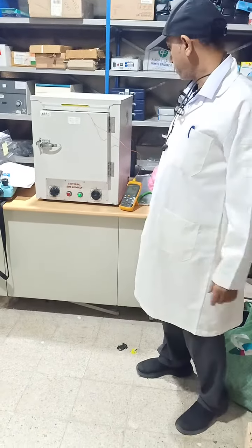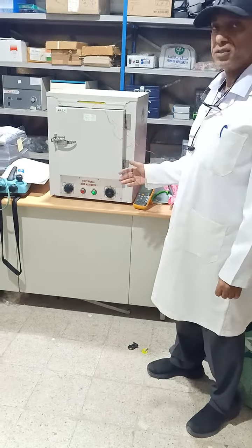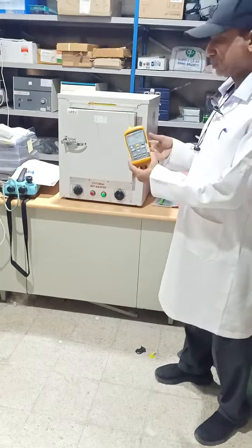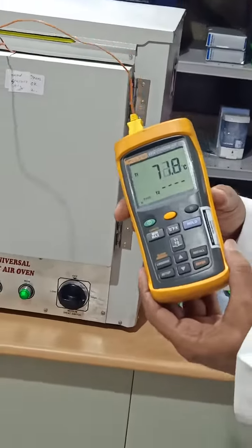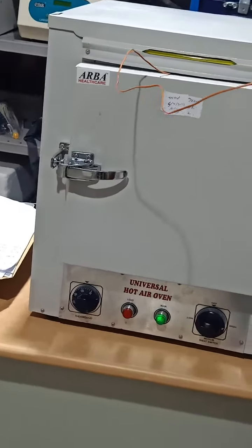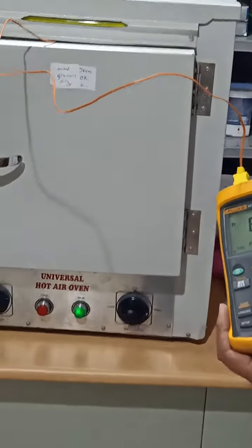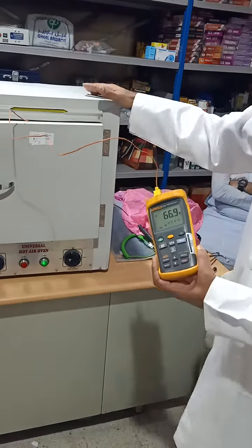Assalamu alaikum. In this video I will demonstrate the calibration while checking the temperature of that oven. We have a temperature meter here — it is certified and calibrated. We put the sensor inside the oven and we will compare the temperature between this oven and the reference meter to confirm whether the instrument is working fine.